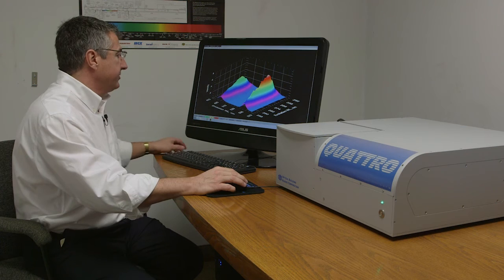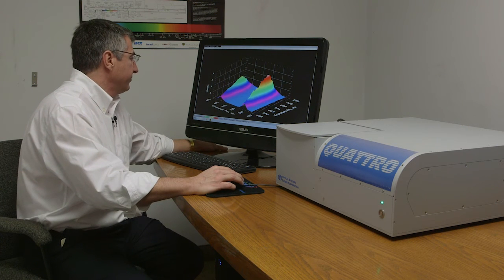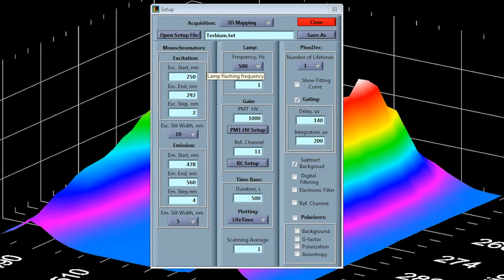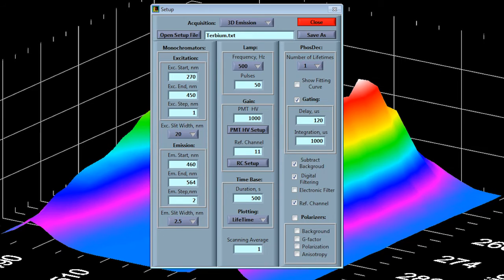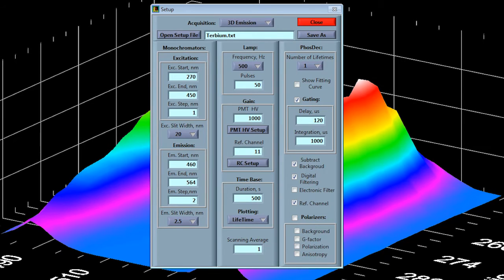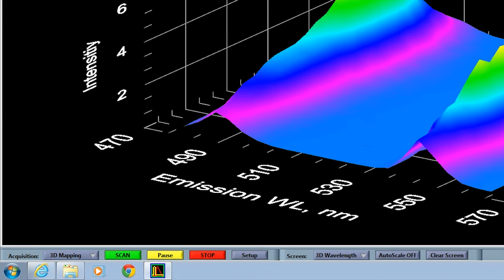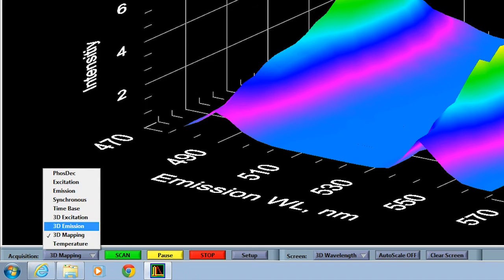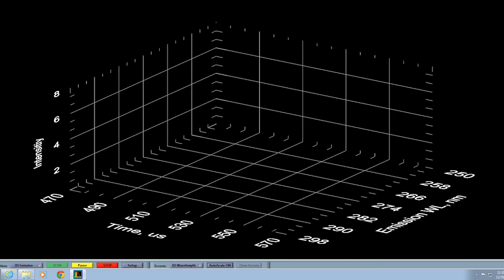And so we're going to do an acquisition now, in this case where we adjust the setup parameters, not to do a 3D mapping, but to do what we call 3D emission, where we are assuming now we're scanning the emission monochromator and we're going to collect versus phosphorescence decay on the microsecond timescale. So we set up the parameters for this particular protocol, close the setup button, we're now going to select 3D emission as our acquisition choice and just simply hit scan.